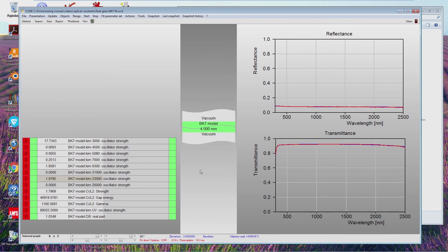We are now in the position that we have a very nice model for the substrate. In the next tutorial, I will introduce thin films of two different oxides and show you in detail how we set up an optical constant model for oxides and also for nitrides from scratch, showing you every detail. Fortunately, these models will be simpler than the glass model here — usually it's just a constant and one OJL model, and that's it. But that will be explained in the next tutorial. Thanks for your patience today. Bye-bye.